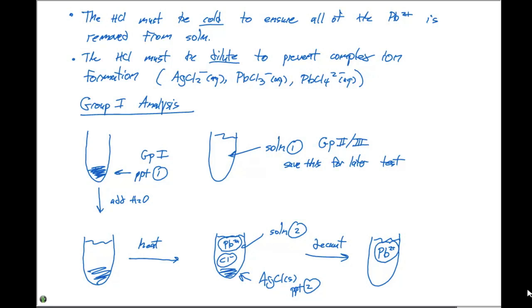So in our test tube right now, we have lead two plus ions and Cl minus ions. At this point, the only cation we want in solution is lead two plus. And this is an effective way to separate all these out.